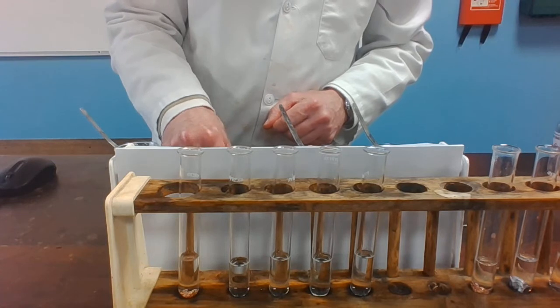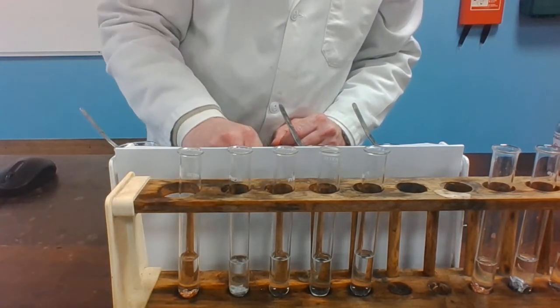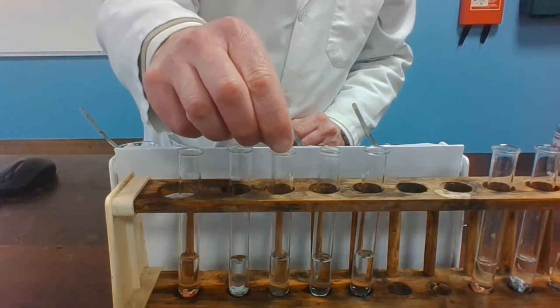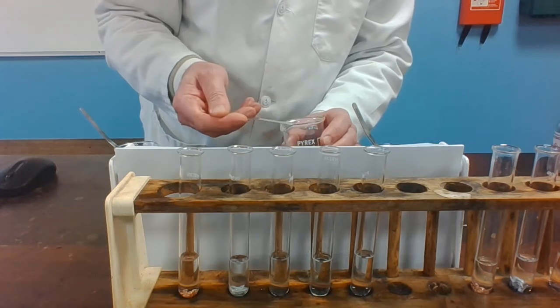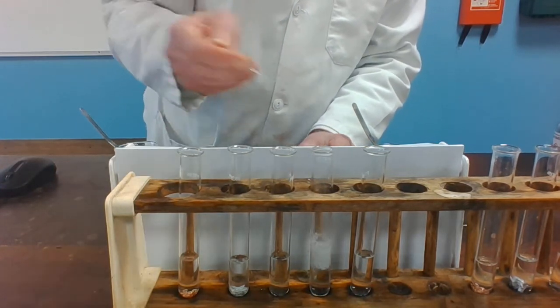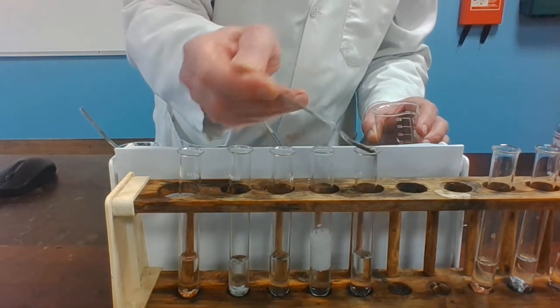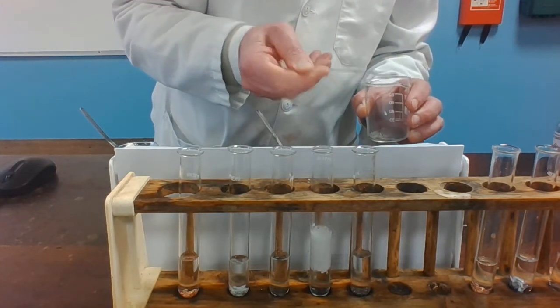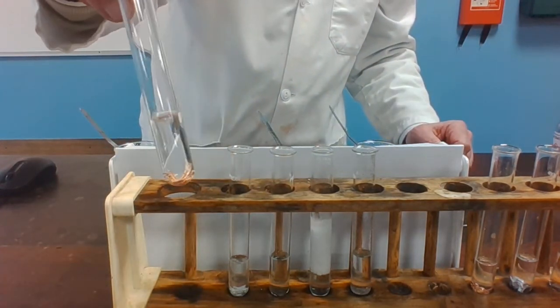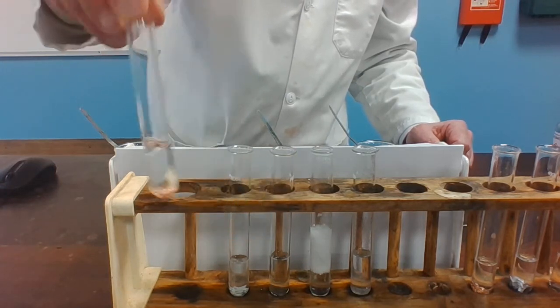Zinc granules in dilute hydrochloric acid. Lead in dilute hydrochloric acid. Magnesium turnings in dilute hydrochloric acid. And iron filings in dilute hydrochloric acid. Is there any evidence of a reaction? If so, is it fast, medium, or slow? Copper.